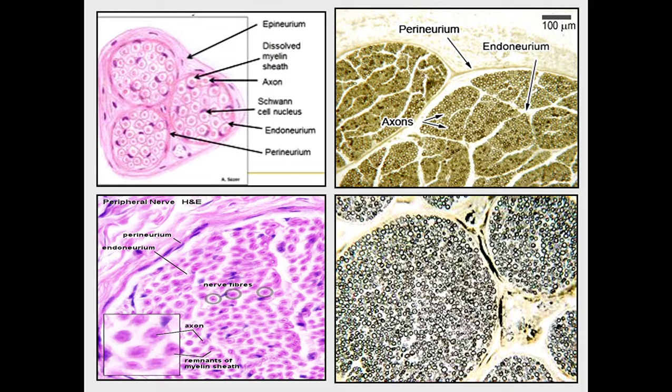In this one is the osmium fixation. We use osmium fixation to stain the myelin, the lipids which surround the axon. So darkly stained areas, brown to black areas, represent the myelin sheath. Those are a number of axons. Each rounded structure of those represents a transverse section of an axon. The perineurium surrounds a group or fascicle of axons, while the endoneurium surrounds the individual axon, while the epineurium surrounds the whole nerve trunk.